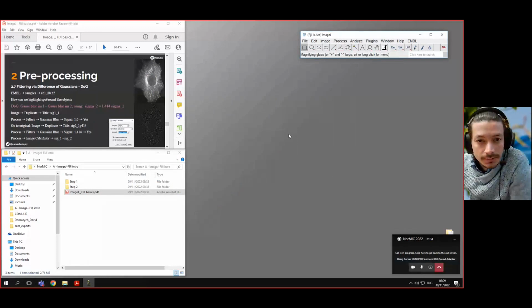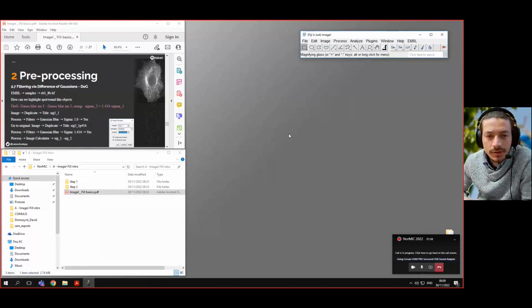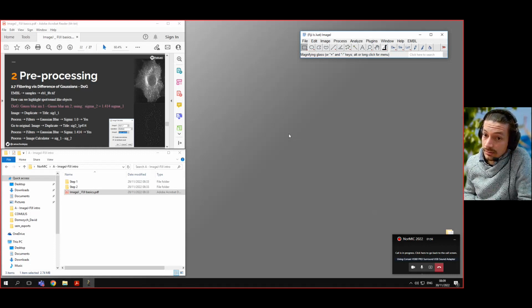Hello. So in this small video, we are going to be running one of the small demos from the lecture of today, and that's going to be for pre-processing images via a method which is called Differences of Gaussians. A difference of Gaussian is basically a method that we use to enhance objects of a particular size against all the background, more or less in a uniform way. You will see as an example right now.